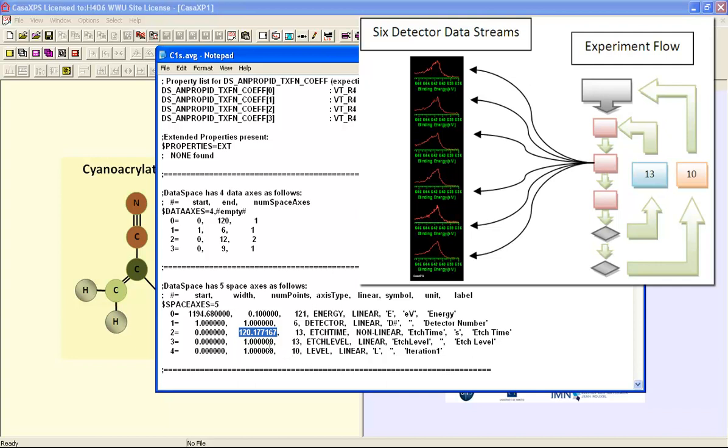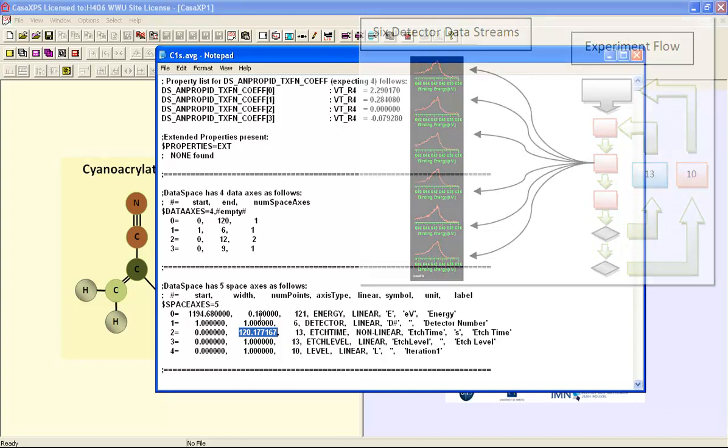So what happens is rather than having one etch sequence of 13 etch cycles, collecting spectra in each case, we have 10 sets of such measurements. So the data file contains effectively 10 sputter profiles.